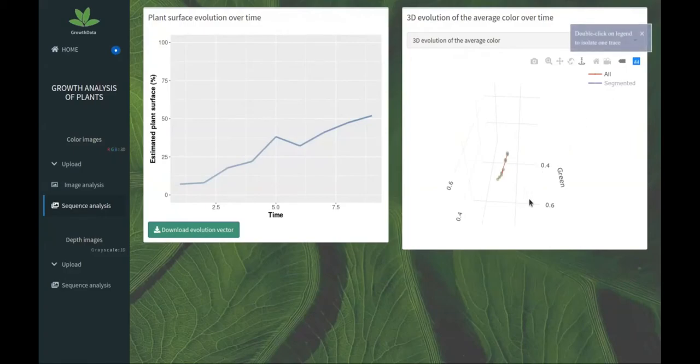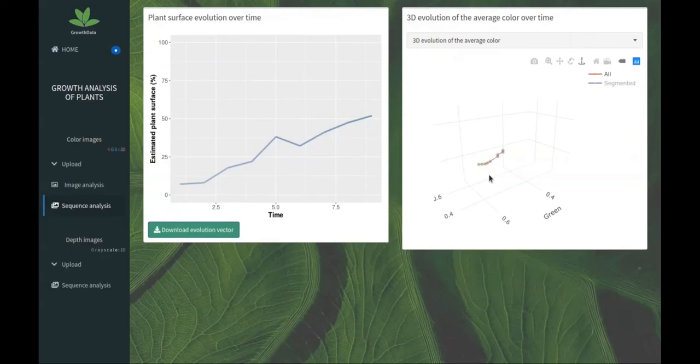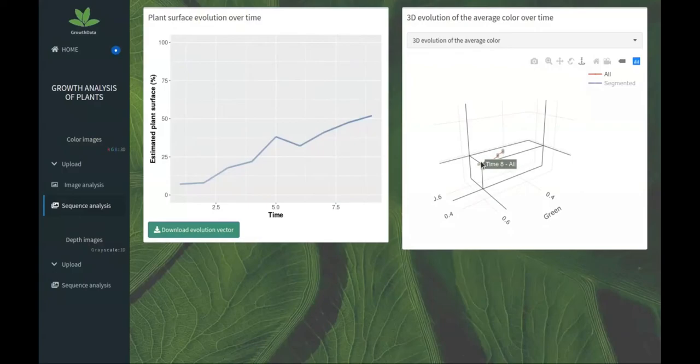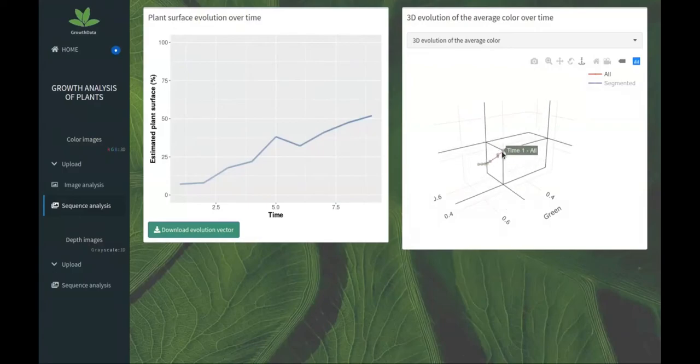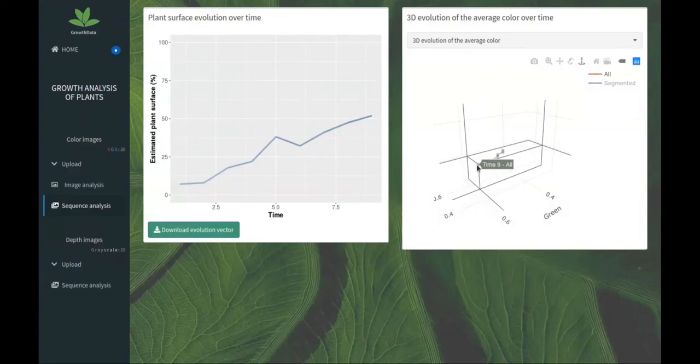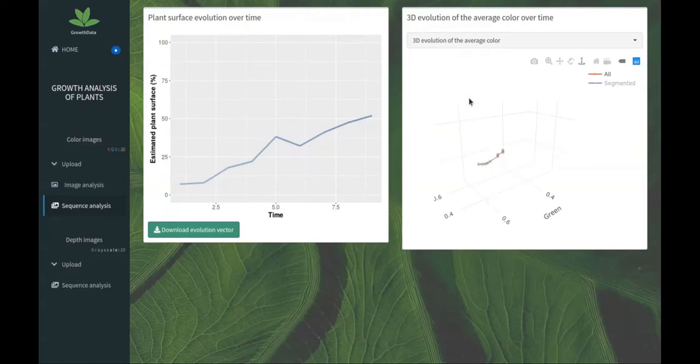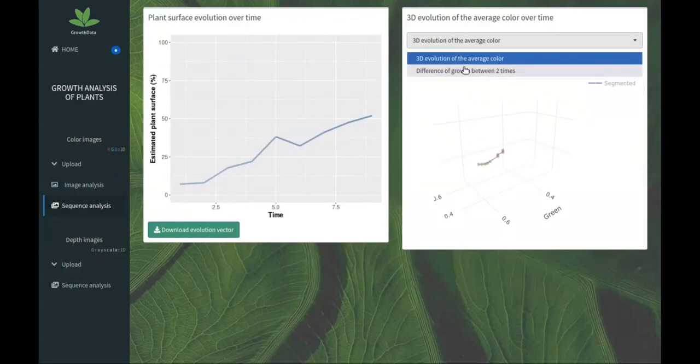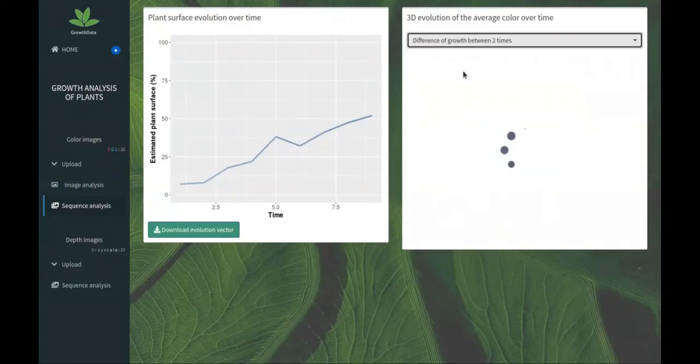We have an evolution of the covered surface by the salads on the images. We also have a 3D evolution of the average color. We can select either all the pixels of the image or the segmented pixels of the image. Here we have an evolution to the green along the sequence of images.